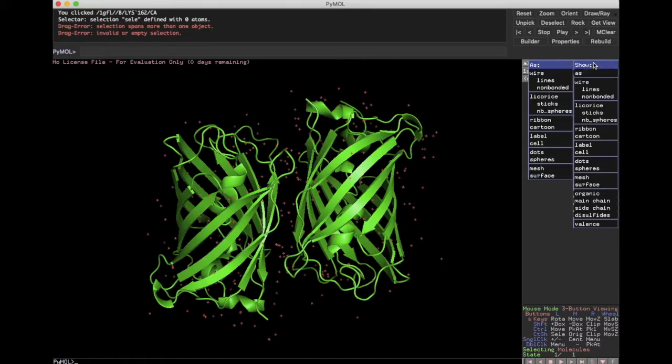And you can use the show tool here to actually show atoms and molecules. If PyMOL loaded your proteins or nucleic acids showing every atom, as you'll see later, it's pretty confusing, and it's really hard for us as humans to see patterns. And so by showing just the secondary structure off the get-go, it really sets a baseline of understanding what we're dealing with.